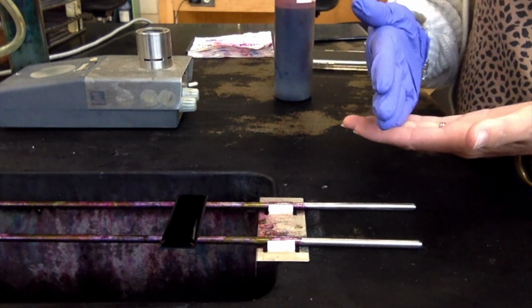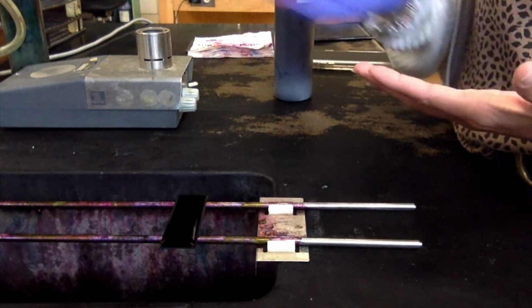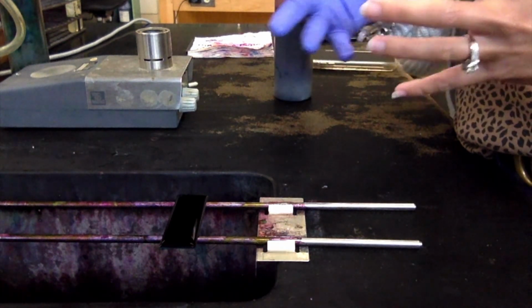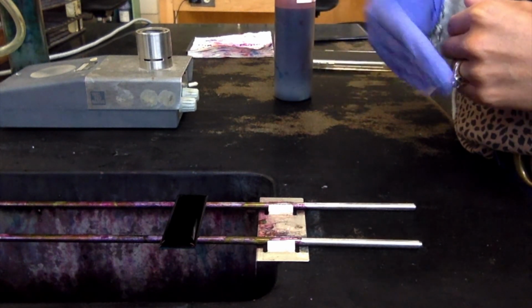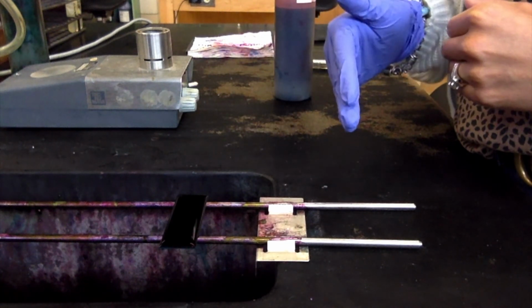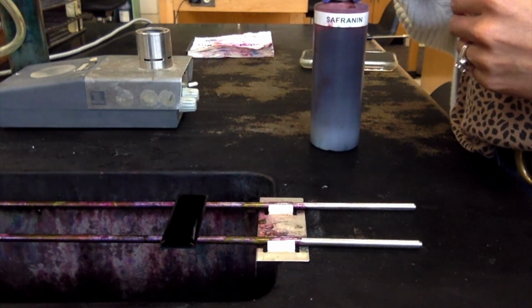Now, when we do the decolorizing step where we just simply rinse with water, this stain is going to come right out of the vegetative cells because there's really nothing holding it in. But it's going to stay inside of the spores. So after the decolorizing step, if we do it correctly, then our spores will still be green and our vegetative cells will be colorless. So then we're going to counterstain with the Safranin.